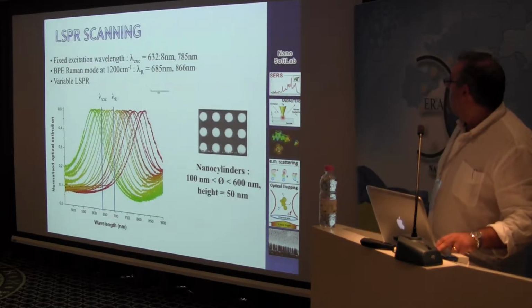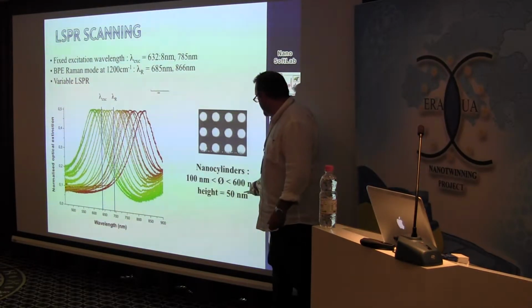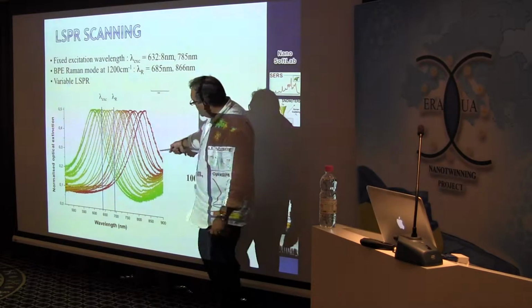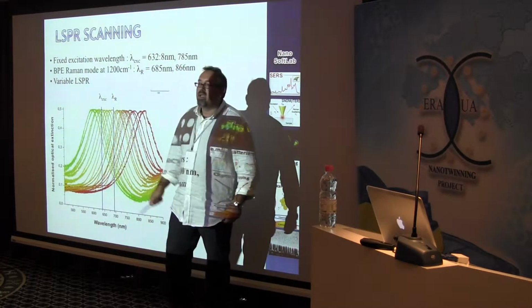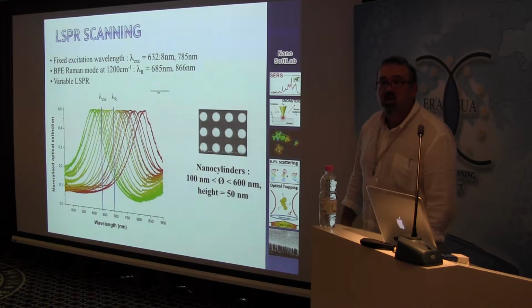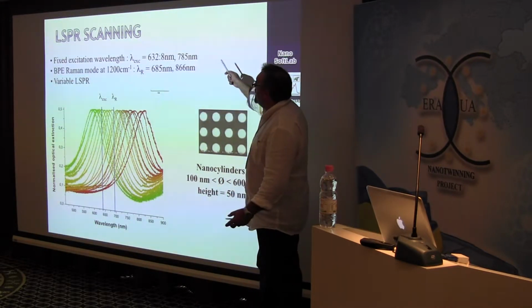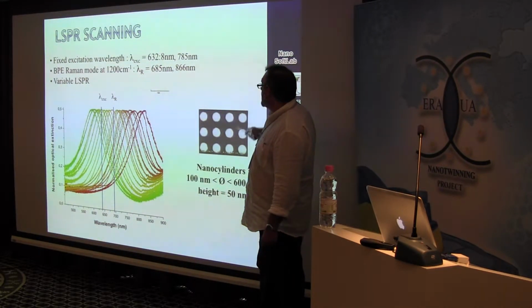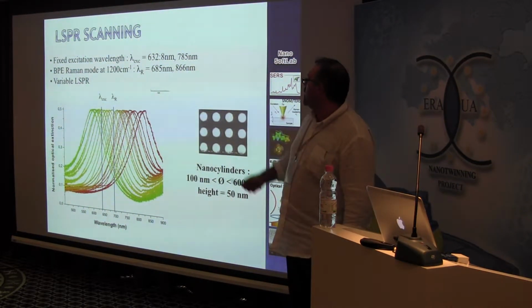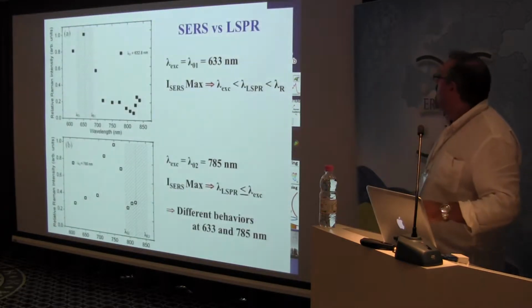So, if you deal with nanoparticles that have this kind of diameters, size matters, in the sense that the localized surface plasmon resonance is shifted by several tens or even hundreds of nanometers. So, if we have a fixed laser and a fixed molecule, choosing the appropriate diameter gives the appropriate localized surface plasmon resonance, and we look for the maximum enhancement.